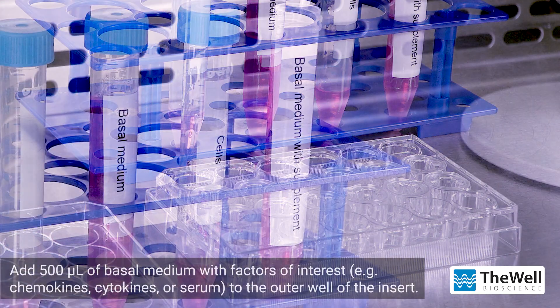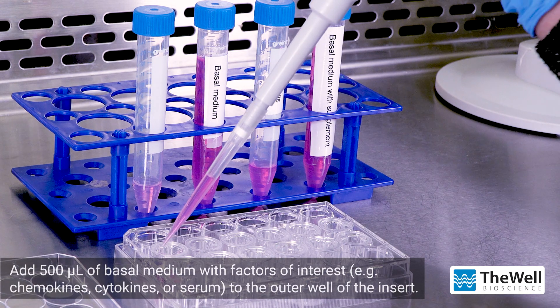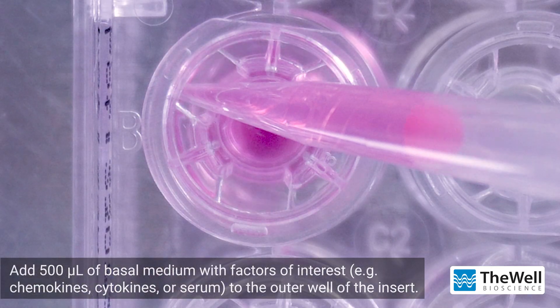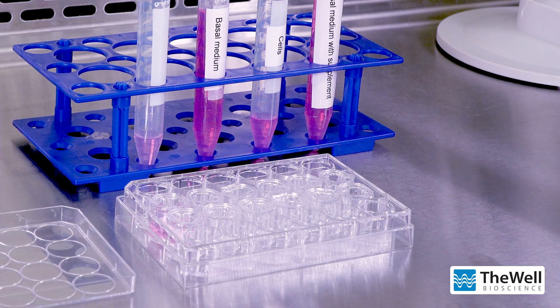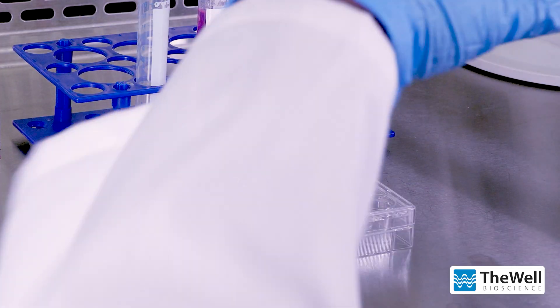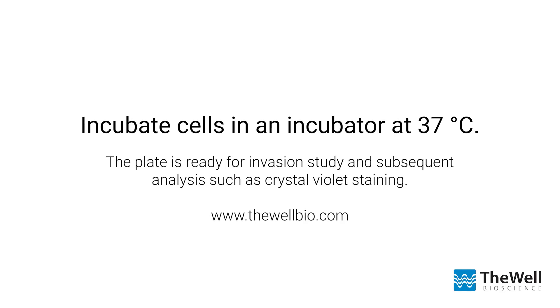To the outer well of the insert, add 500 microliters of basal medium supplemented with factors of interest such as chemokines, cytokines, or serum. Lastly, incubate the plate in an incubator at 37 degrees Celsius. The plate is ready for invasion study and subsequent analysis, such as crystal violet staining.